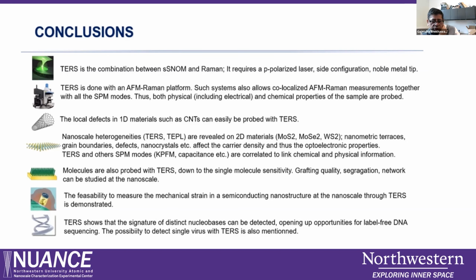With it you can go from about -4 degrees Celsius to 750 degrees Celsius, and you also have the capability to apply a magnetic field. Great, we have that stage that can be integrated into this system.